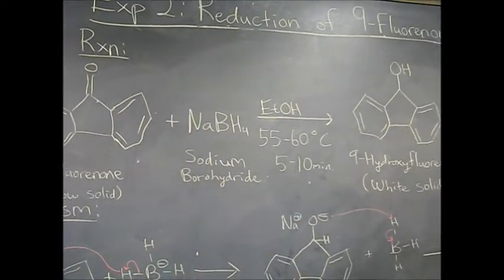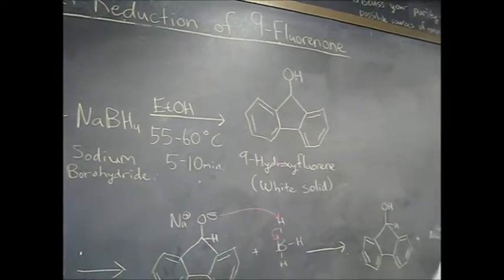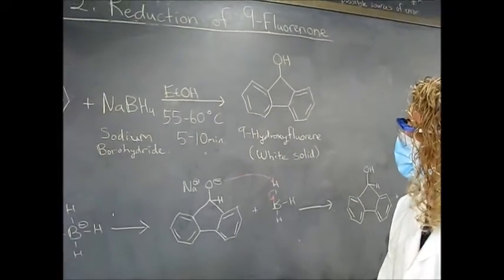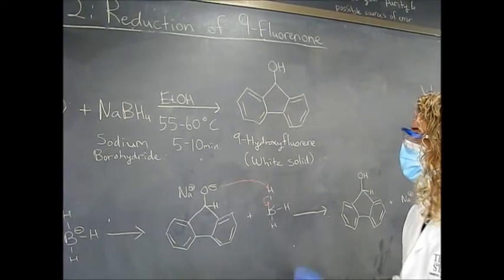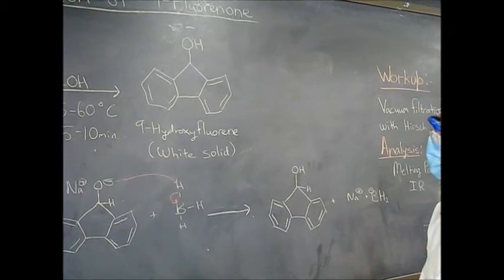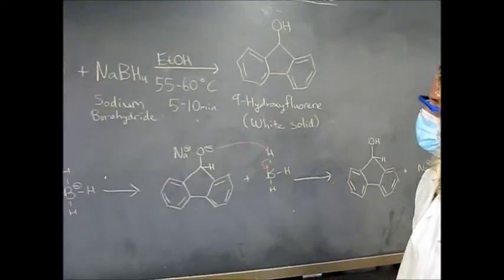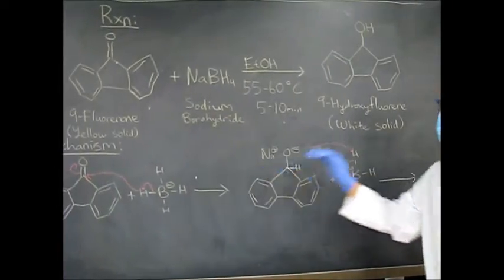Sodium borohydride as our reducing agent. We'll run the reaction in ethanol as the solvent, warm it to about 55 to 60 degrees Celsius, and run it for about 5 or 10 minutes. The product we're going to get is 9-hydroxyfluorene, and this is going to be a white solid. So this is a good way to track the progress of the reaction. We'll see the solid go from yellow to white.